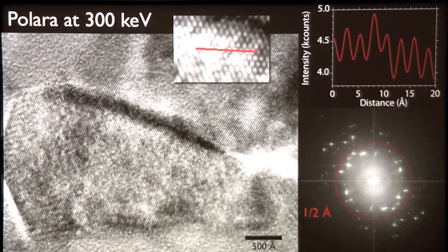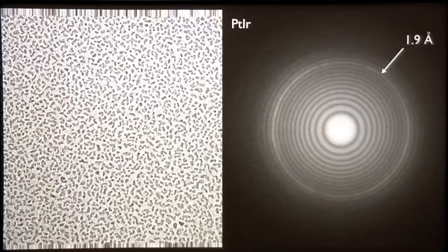And that's because we have an extremely well-maintained electron microscope facility here, and because these microscopes have never been limited by the optics. It's always been by the samples, our ability to collect the signals, and our ability to process the data. So the bottom line is, every time I come up to a microscope, I put in a test grid like this one. This is, for example, platinum iridium.